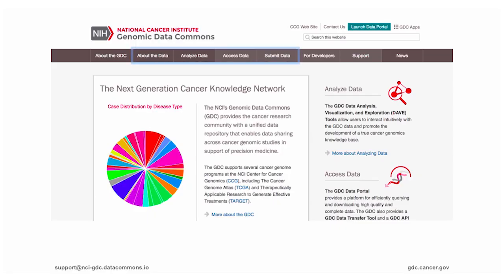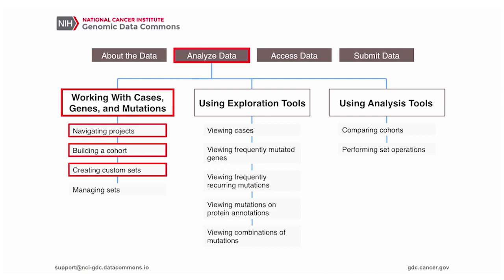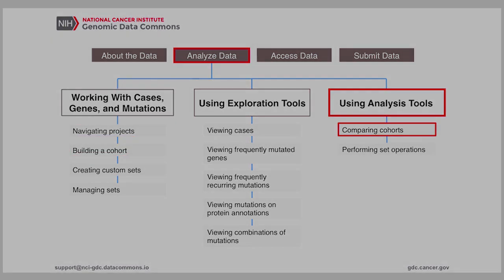The GDC has many features for analyzing, accessing, and submitting data. In this video, we will demonstrate some of the features available for working with cohorts or sets of cases by creating, managing, and comparing cohorts.